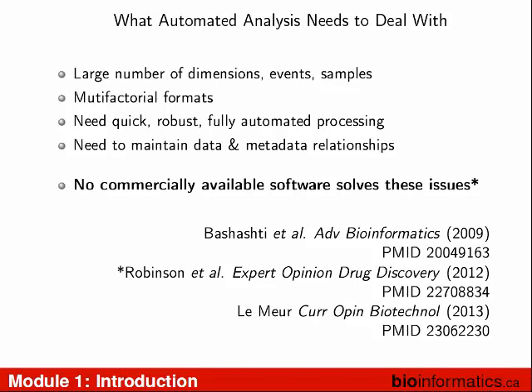So one thing we have is file names. We spend so much time parsing file names. You would not believe how such a simple thing can be so complicated. People use the file names to mean something, and that's okay as long as you do that in a consistent way. So you don't change underscores with spaces. You don't change underscores and dashes. You think it's a simple thing, but it absolutely, positively will kill you when you're doing automated analysis.